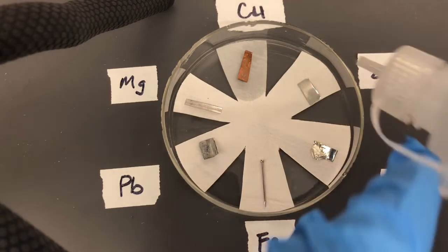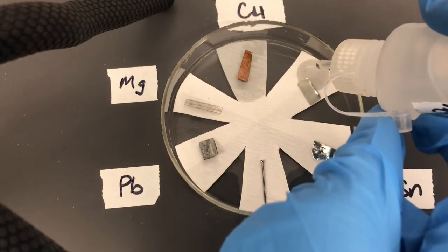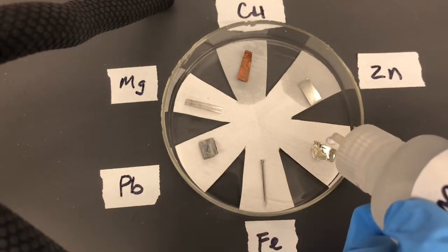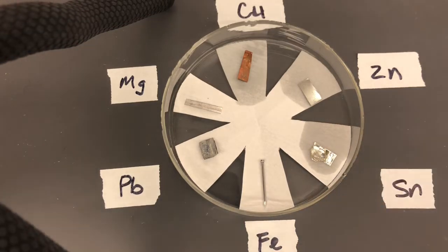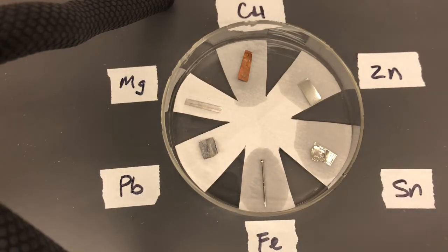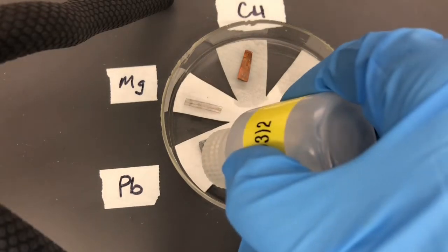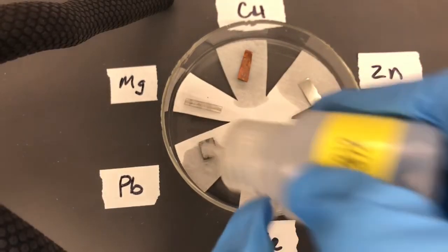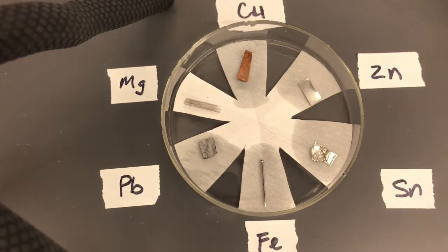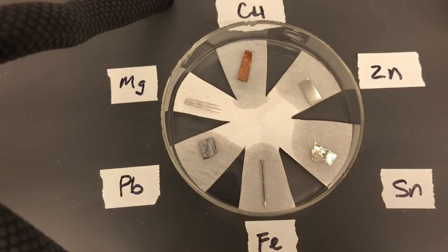Next, I'm going to add a couple of drops of zinc 2+ near the zinc metal. I'm going to add a couple of drops of tin 2+ near the tin foil. I'm going to add a couple of drops of iron 2+ on top of the iron nail. I'm going to add a couple of drops of lead 2+ near the lead metal. And then finally a couple of drops of magnesium near the magnesium strip.